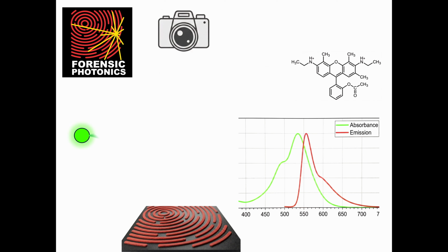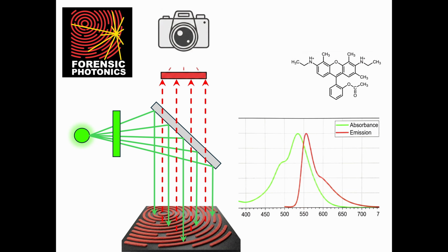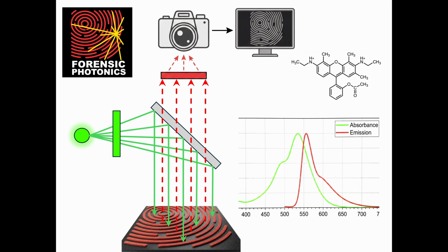You've probably seen something like this before. Fluorescence works by exciting a fluorescent molecule with a specific color of light. Then, light with a slightly shifted color is emitted, which we can use filters to isolate and detect. These light energies are characterized by their spectra, the excitation and emission curves for that specific molecule, rhodamine in this case. But let's use a different perspective.